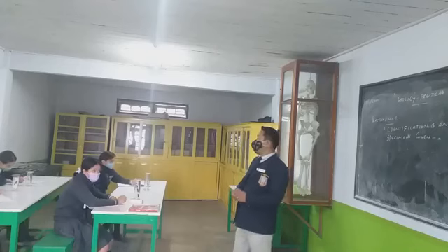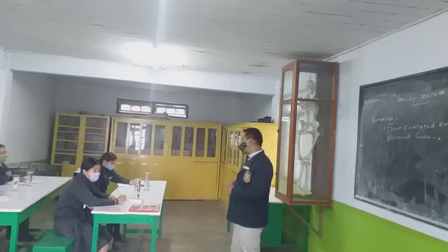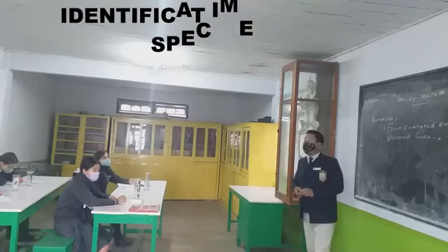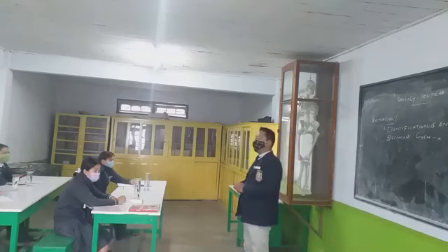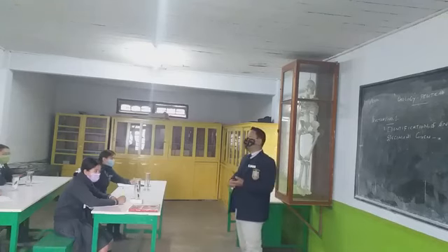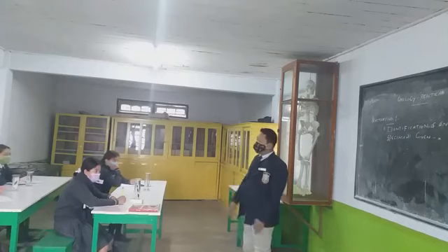So, dear children, we'll have a practical class today. Here we see mainly identification of animal specimens. There are so many specimens there. Some of them are vertebrates and some are invertebrates. They're in the place where they are all stored.